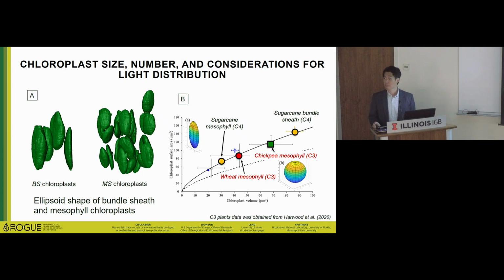Yep. One way to look at that would be to compare your Z-stack images in the Airyscan 880 and the serial block face. Because those changes in shape were large, you would see them. If you did the two types of imaging, you should be able to compare them, to see if the fixation was causing a problem or not. Okay, I will look at the slide image.